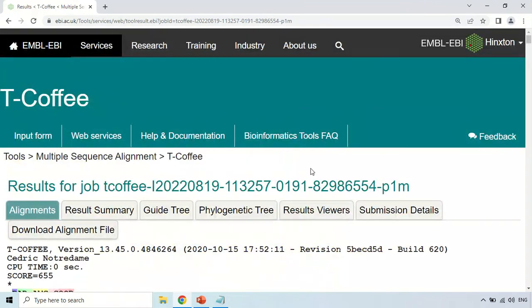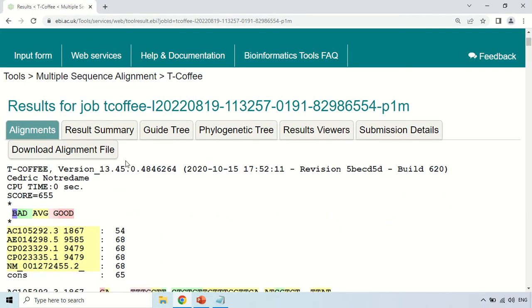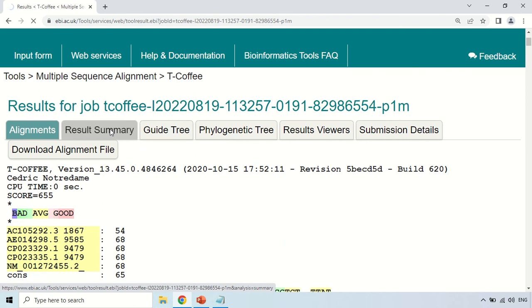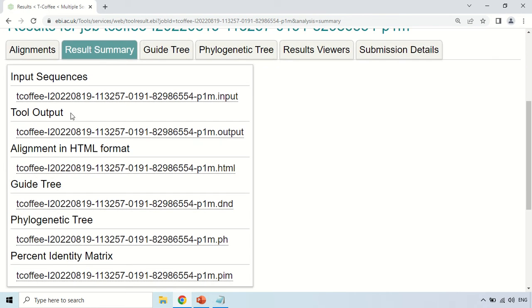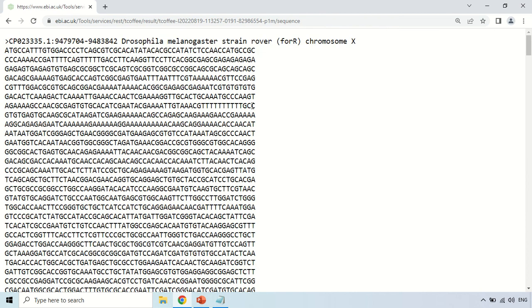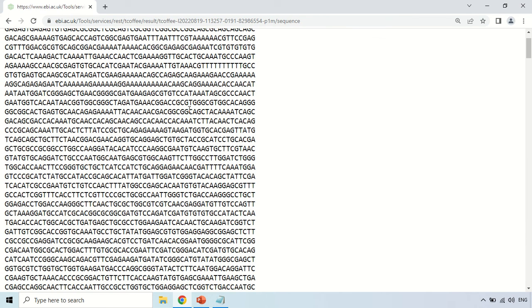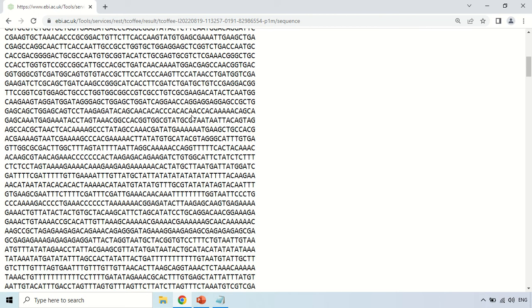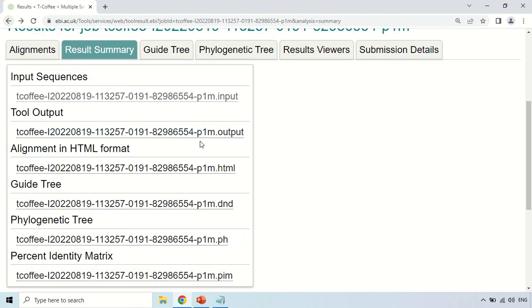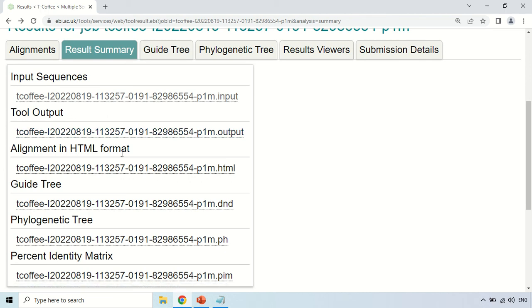The next section is the Result Summary. If you click on the Result Summary section, it will show a summary of results. First is Input Sequence — clicking here shows the sequences you provided to the tool for multiple sequence alignment. Similarly, the Output section shows the output, and the Alignment section shows the alignment as demonstrated under the Alignment tab.